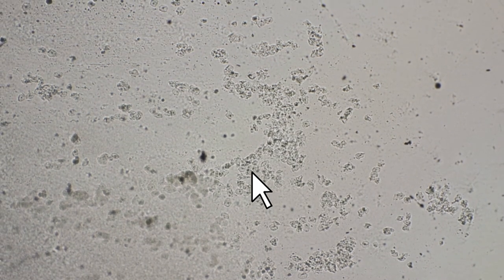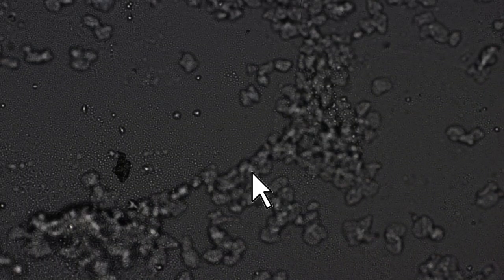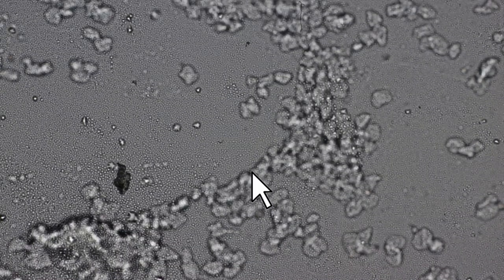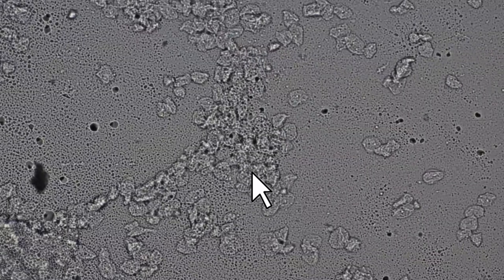I'm now using the 4x low power. Again, no water. So this means that the resolution is not going to be so nice. Here you see them a little bit better. This is now the 10x magnifying objective. There's lots of dust and dirt also on the slide here.